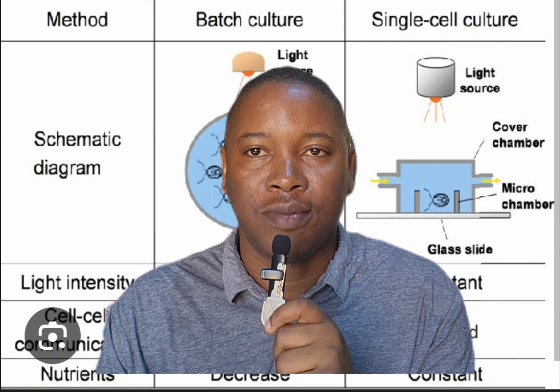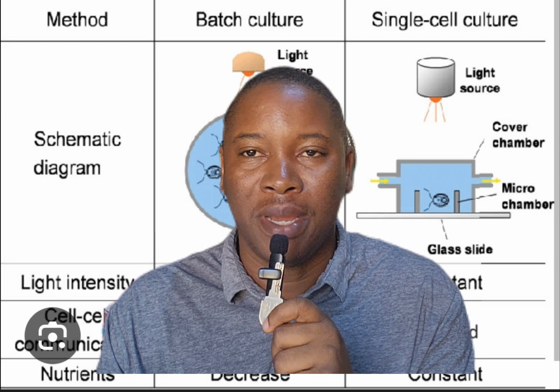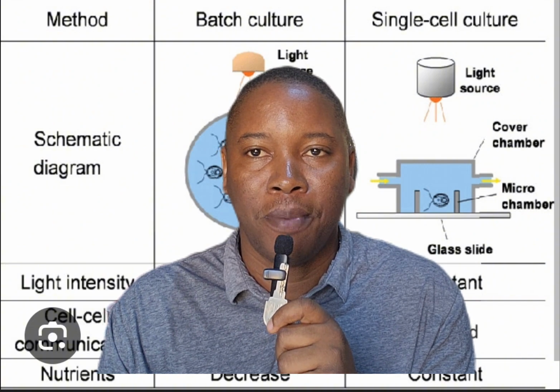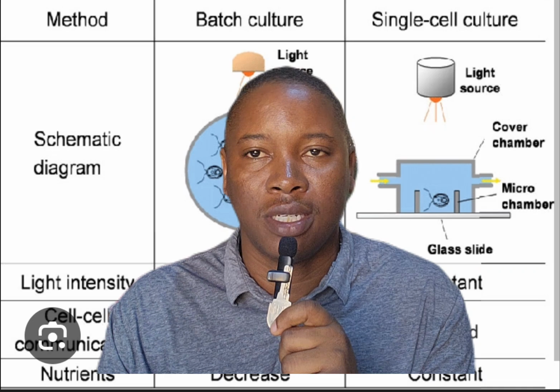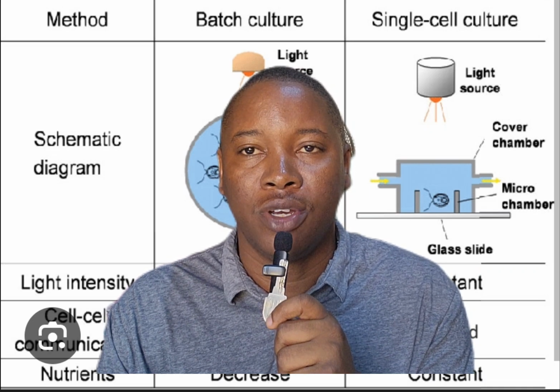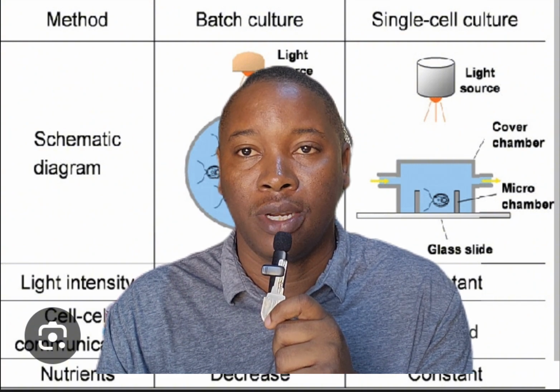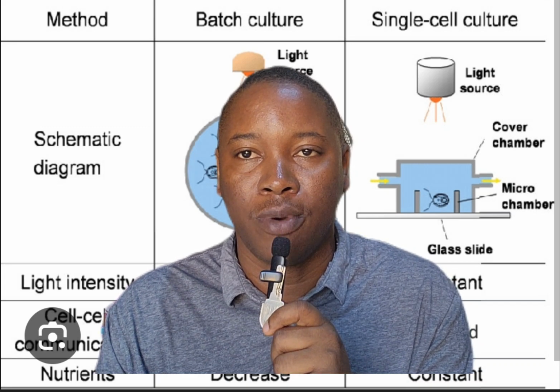We usually sterilize it, depending, you could use a water bath, you could use a heater. We sterilize for a period of time to make sure that there are no microorganisms in the water that is going to grow, and even in the media. When this has been done, we allow it to cool and then we pour into petri dishes. If it is broth, we are not pouring into petri dishes. We're going to just inoculate our organisms into the broth.